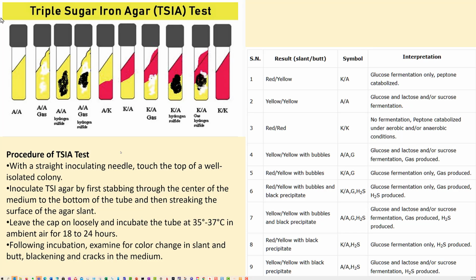Obviously you won't perform the technique to create these, but that data will be given to you for your clinical identification of the unknowns. It's interpreting these to figure out what your unknown is, and you'll have a chart to go by.